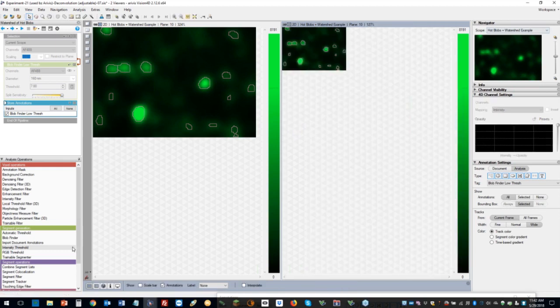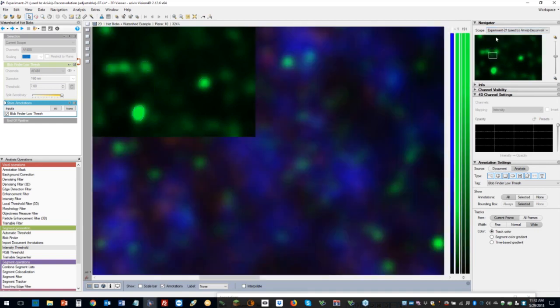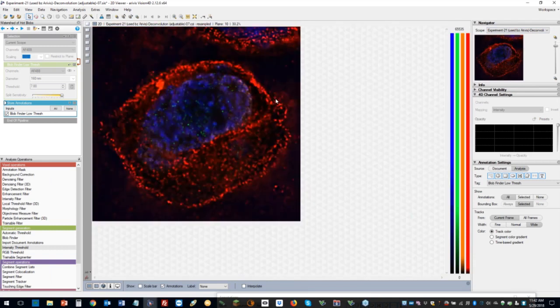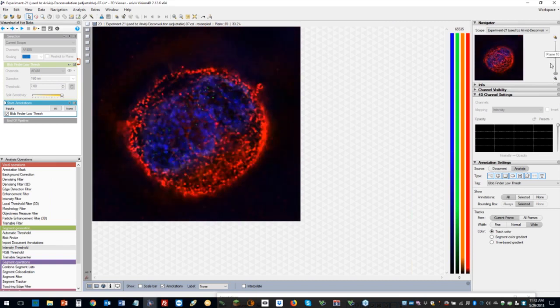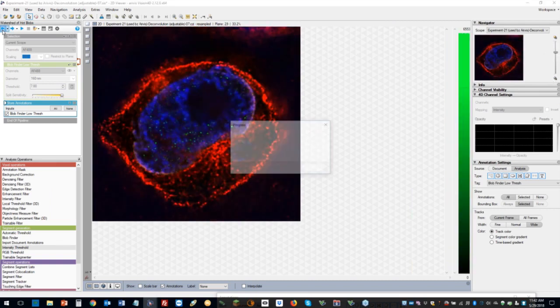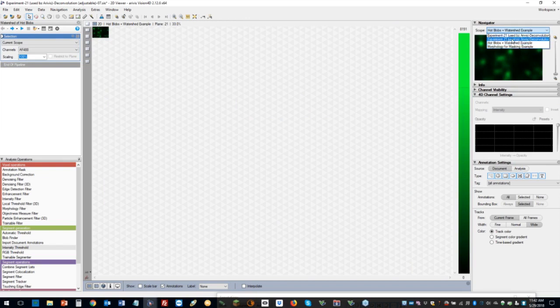So let's move to another example. So let's go back to this guy. So this cell. So now we're really looking at the cell. Okay, we're going to look at it in 3 dimensions. And what I've done is I've already computed... let's go back, I need to go backwards. Okay, and we're going to just move back to the cell.